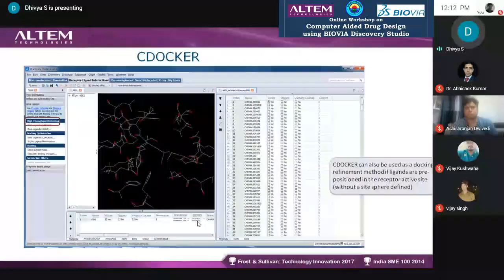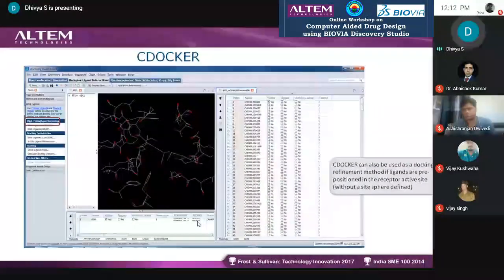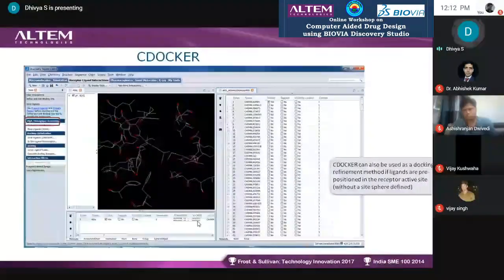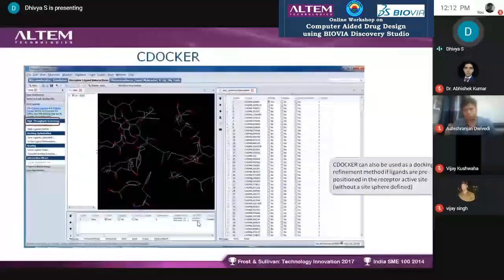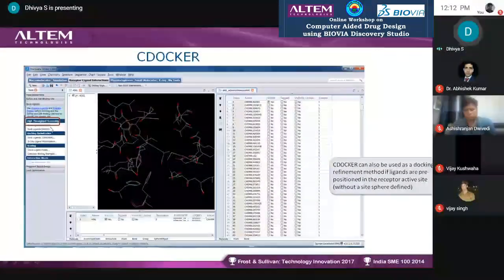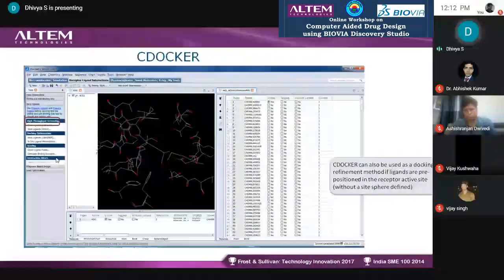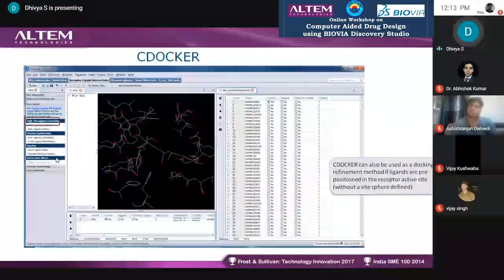Input your ligand molecules to the specific site. If after ADME screening you have more than thousands of ligands, I would suggest going for high-throughput screening using LibDock rather than CDocker. Using LibDock, you get good molecules from scoring functions, and then you go for CDocker for more refined scoring and analysis. If you have only hundreds of molecules after screening, it is feasible to go directly for CDocker.